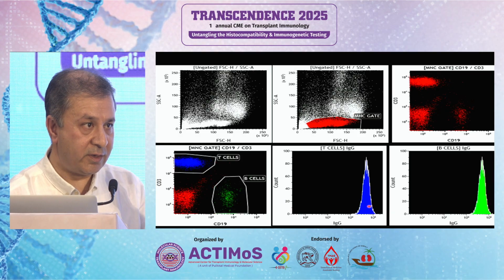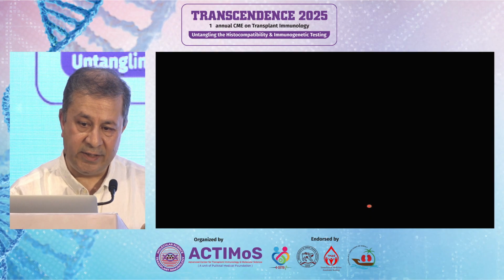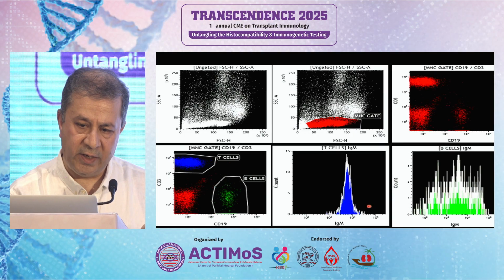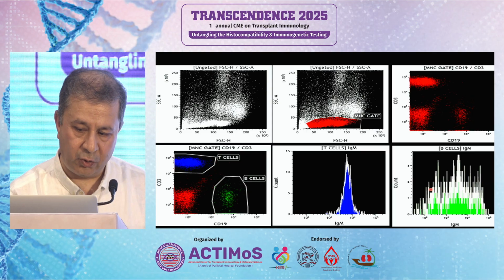And therefore, median is what is preferred and not the mean. And this is how the IgM part of it goes. I'll not get into details. Again, the IgM part of it is seen the way it is seen in this particular picture over here.